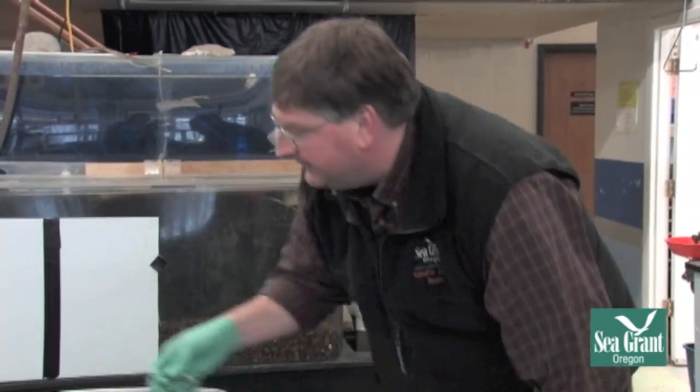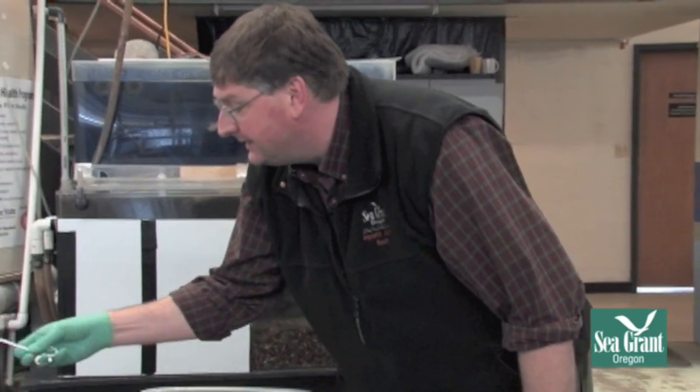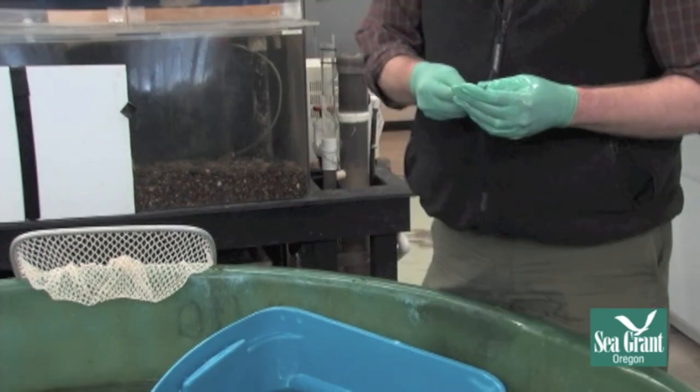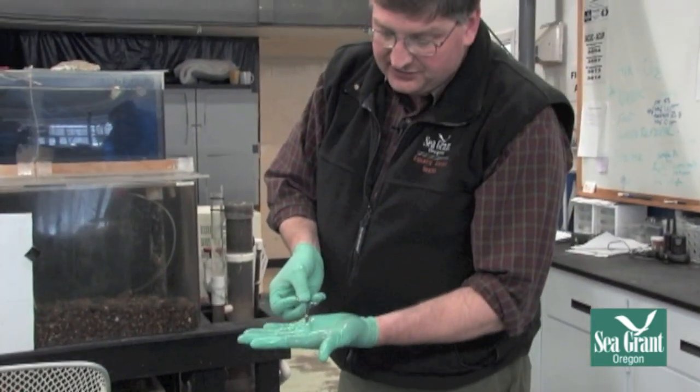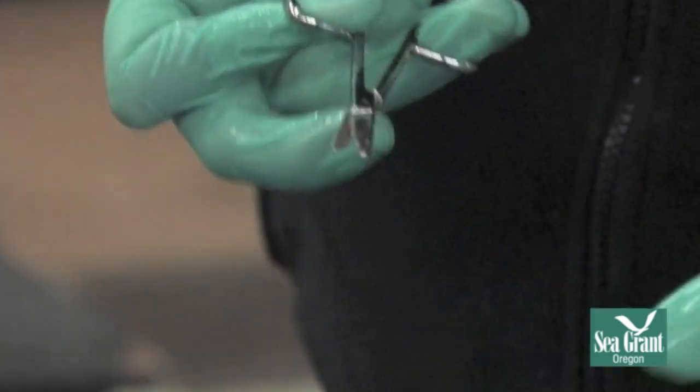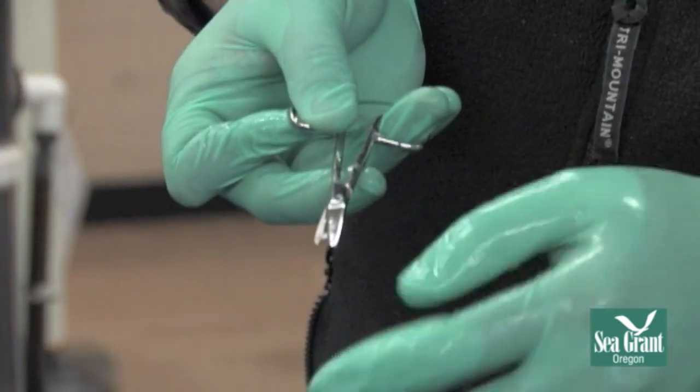The way we do a gill biopsy is we use what are called suture removal scissors. You can use cuticle scissors or other small scissors, but you don't want to have any sharp tips, because if the fish moves while you're in there, you don't want to poke anything.